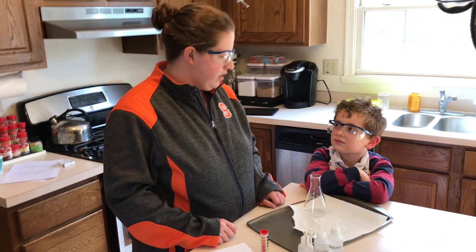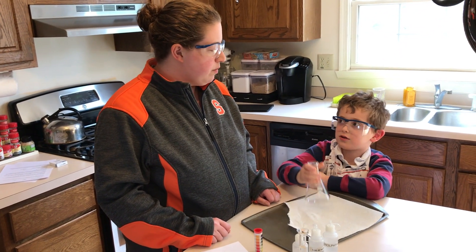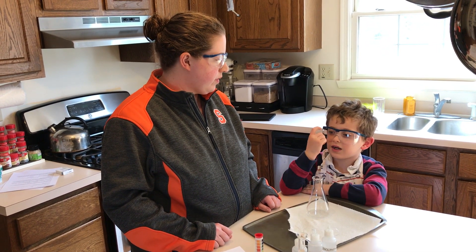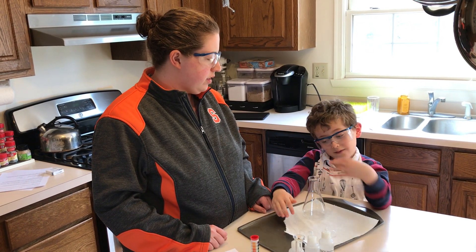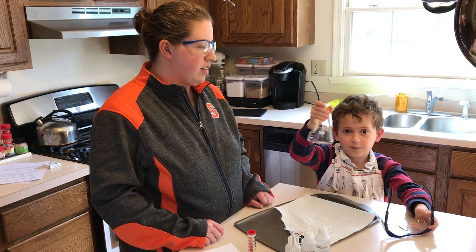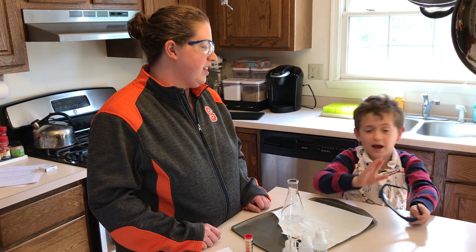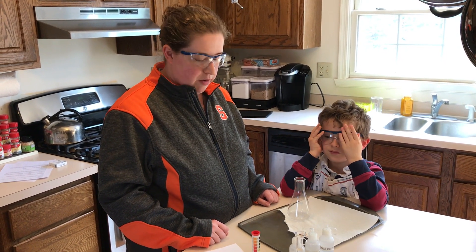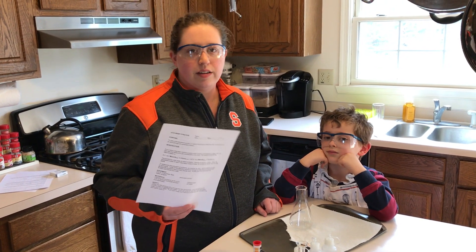Have you done labs like this before? Labs with cups like this? No, I've never done anything like this. But what do you have to have in every lab? What are we wearing? You always have to put on your safety glasses, because if you don't have them and you accidentally shake something and it splashes into your eyes, that could be really bad. Should we drink from here? Never. Okay, so hopefully you have a copy of the lab — if not, go back and get one out.